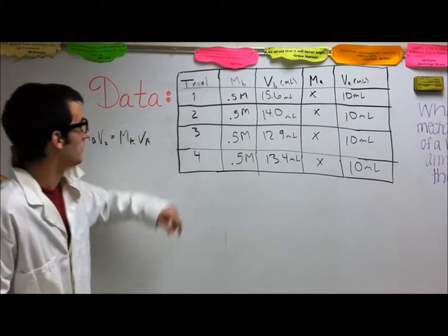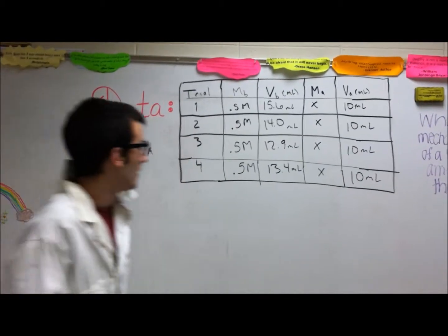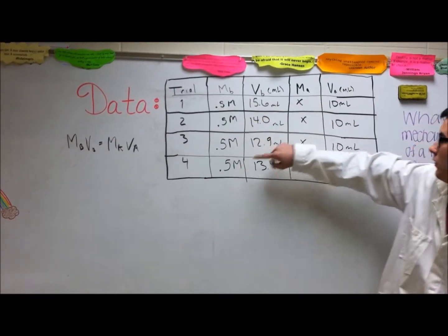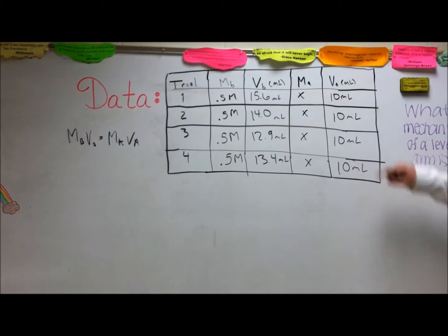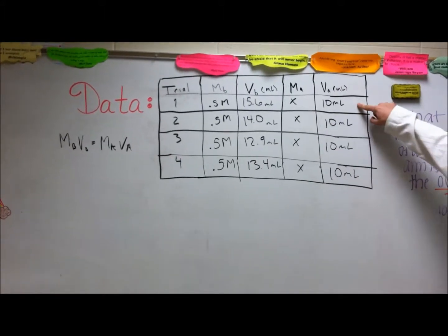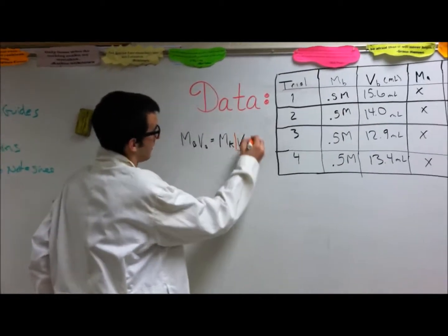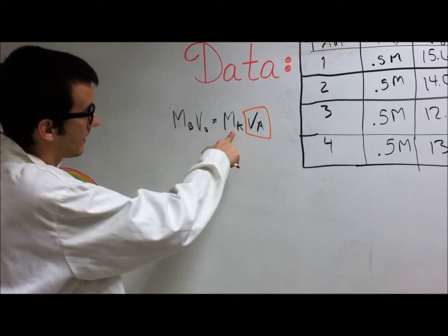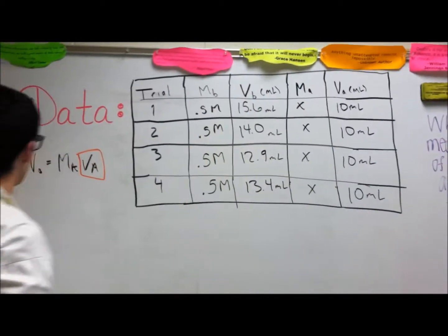So this is the data that we recorded with our 4 titrations. We created a data table for 1, 2, 3, and 4. Going into this lab, we had 3 controls. We knew the molarity of the base that we created. We knew the volume. We measured the volume of the base that we added to the acid during titration. And we were also able to control how much acid that we had in the cup that we were titrating. Now using this chemistry equation right here, we know that the molarity of the base times the volume of the base should equal the molarity of the acid times the volume of the acid. So having these three controls we can solve algebraically.